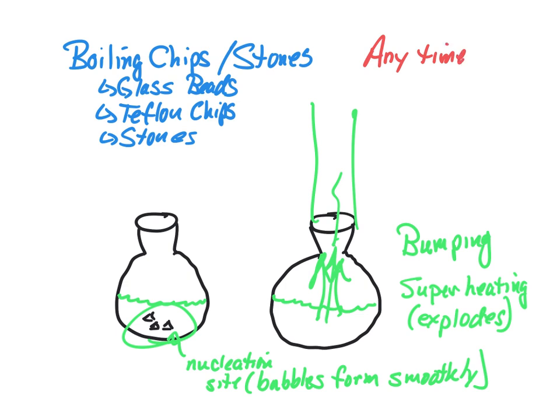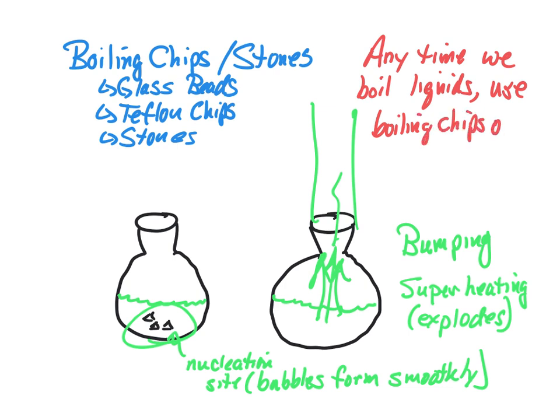Anytime we boil liquids in the laboratory, we will use boiling chips or stones. Okay, that is a must.